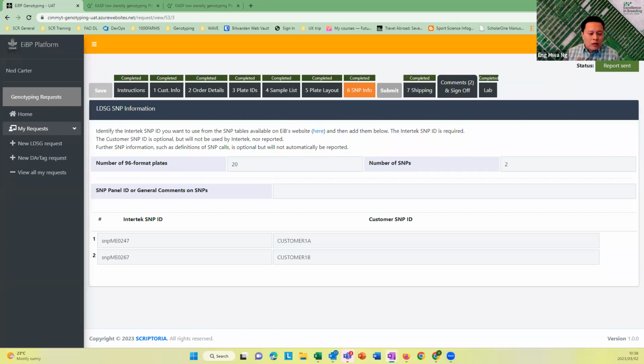There's always the risk of users downloading a static file and keeping it there. And then the next time, for the same marker trait, we have a new version of that marker that may or may not get captured. And then there's a potential error that we may use the old ID. So that's one feature that we know is a critical functionality that we'll have.